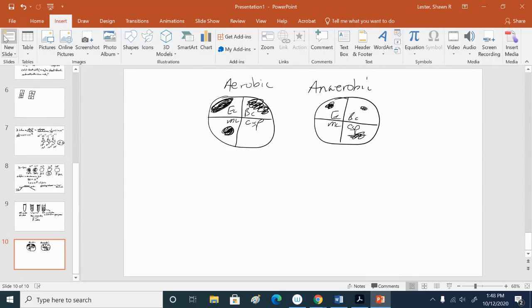And how do we remove the oxygen from the jar? That's actually done chemically, right? Our little chemical packet releases hydrogen, and then a catalyst combines it with oxygen to make water.